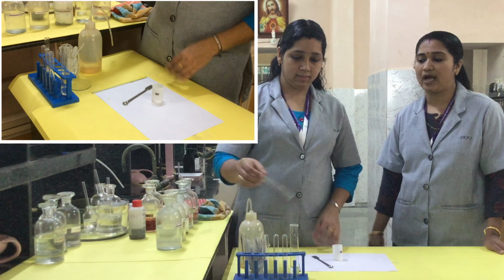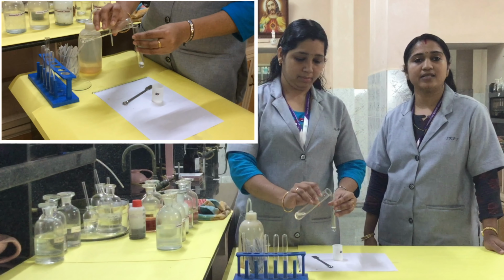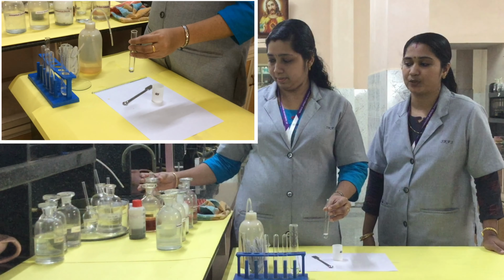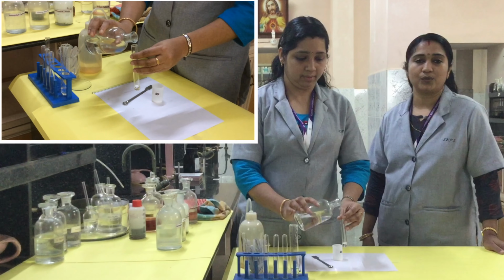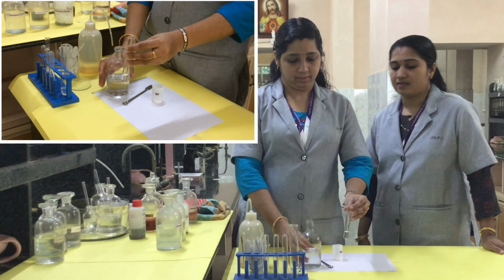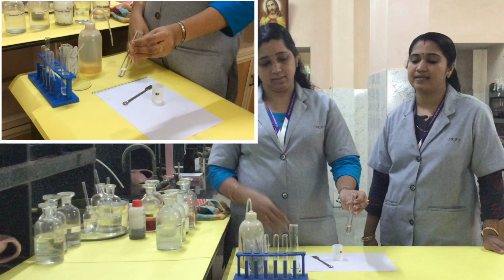Next we have to analyze group 1. For that, take a little of the salt solution in a test tube and add dilute hydrochloric acid to it. The group reagent we are using here is dilute hydrochloric acid. Observe the change. There is no precipitate or residue formed. So group 1, that is lead, is absent.